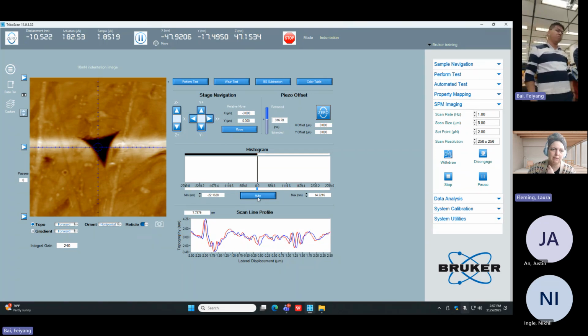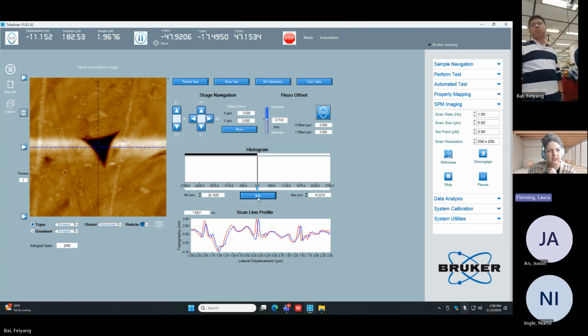Okay. Does that make sense? As we're traveling over this, right? When it does a line here, all of the surface is relatively the same versus when it traces here, this is suddenly much deeper than the sample surface. And so that difference, when you do that average, makes this look much lighter than it does to the north or south, because we're averaging between this and this.